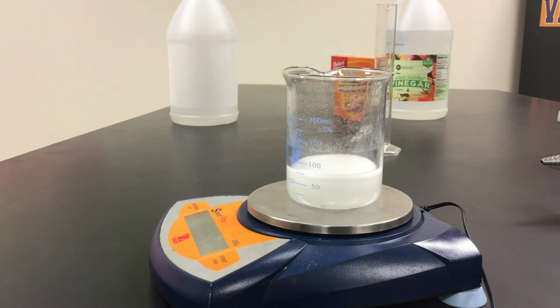And also try your best to get most of the baking soda out of the weighing dish.